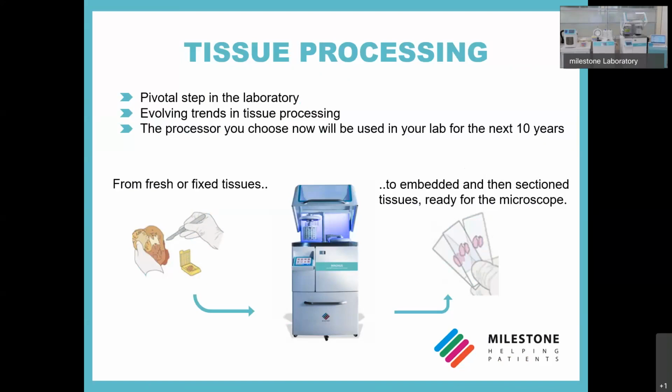Tissue processing describes the steps required to take human tissue from fixation to the state where it's completely infiltrated with a suitable histological wax and can be embedded, ready for section cutting on a microtome.